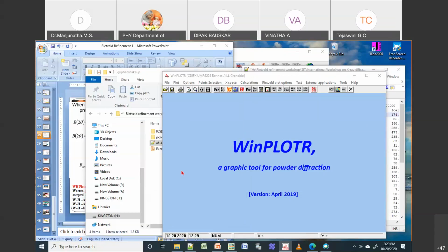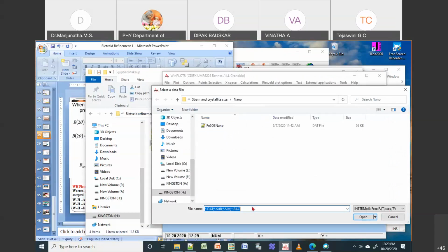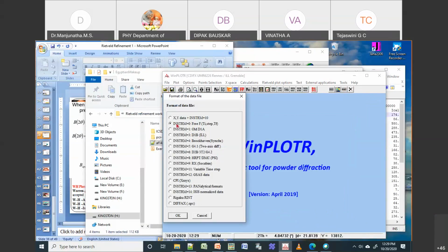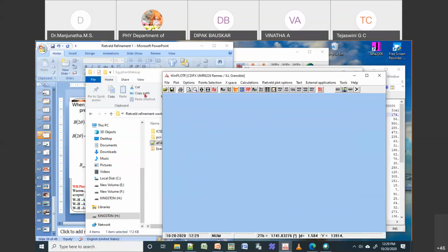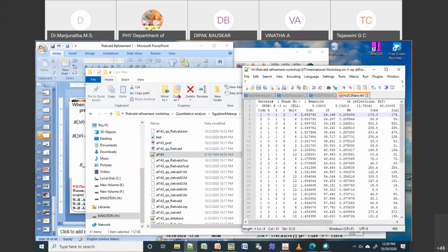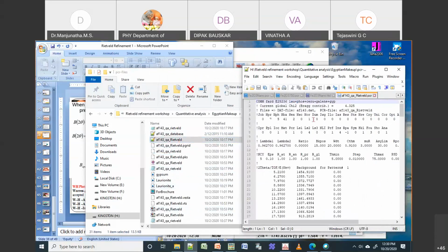I'll go to that particular folder and open this.